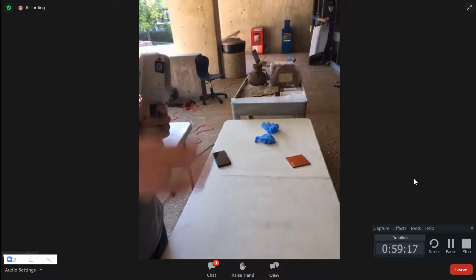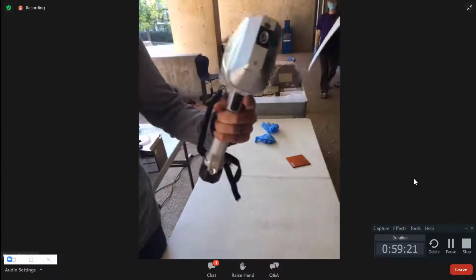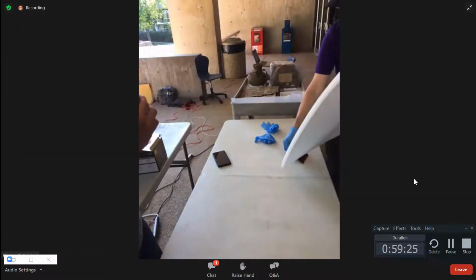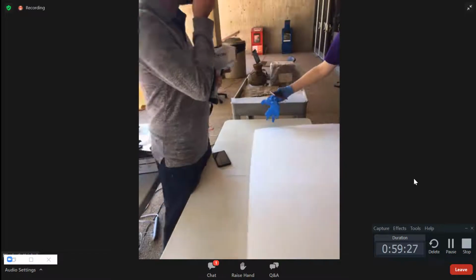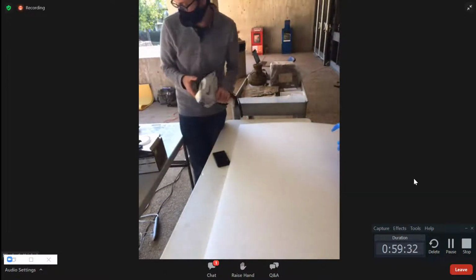And every manufacturer does this. They make the nose replaceable. So it's always replaceable. They might charge you a ton for the replacement, but it's replaceable. But I would not try to clean powderized arsenic if it's on the surface. That's an excellent question. Thank you.